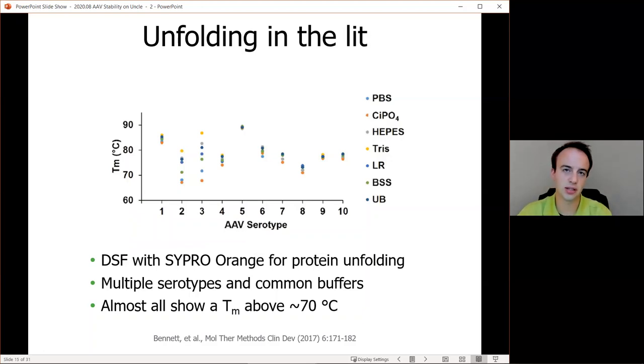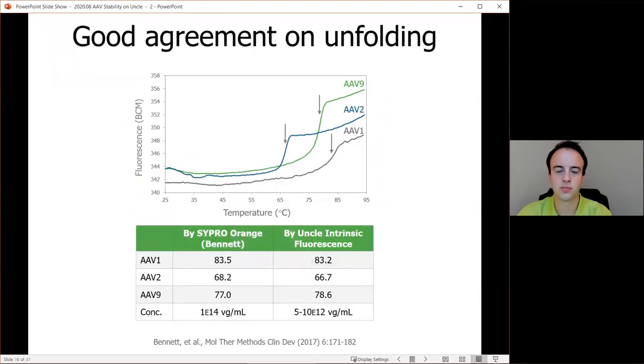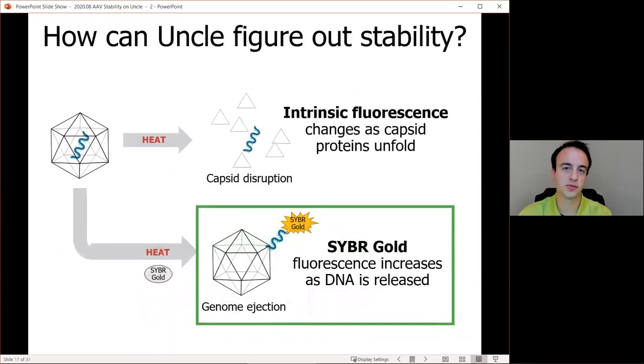So there's both a capsid engineering and selection question that can be addressed with this, as well as formulation questions. If we compare UNCLE's results to those results by Bennett, we have an idea of how that intrinsic fluorescence data matches up with that dye-based fluorescence used in the literature. So here we're looking at AAV serotypes 1, 2, and 9 that have dramatically different intrinsic fluorescence melting temperatures, and you can see the differences across the serotypes, both at the top and shown at the bottom of the table. You can also see in the table the comparisons between the UNCLE data and the Bennett data line up very nicely, and then any differences can be attributed to using a dye versus intrinsic mode of fluorescence or differences in the buffer.